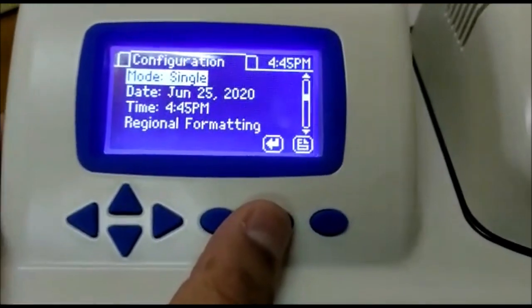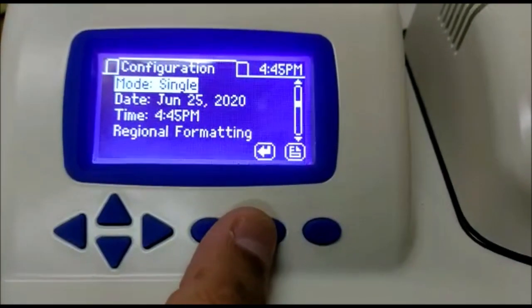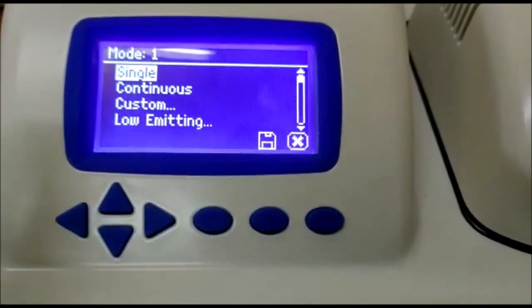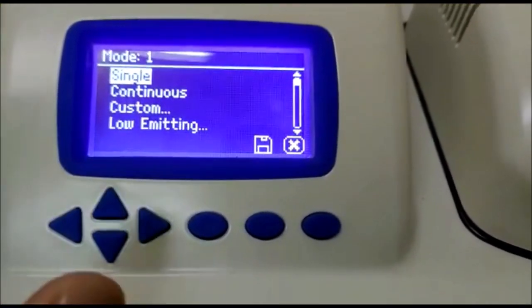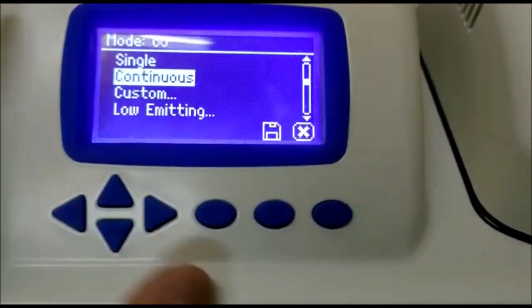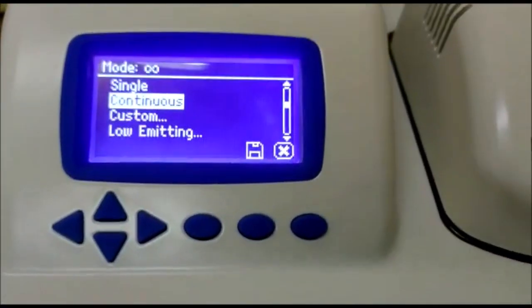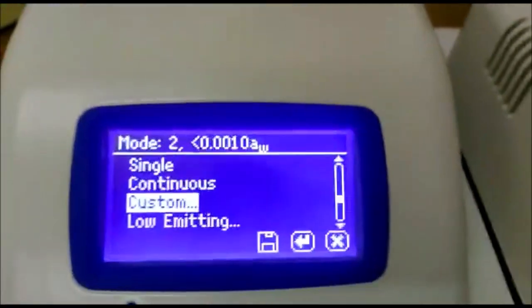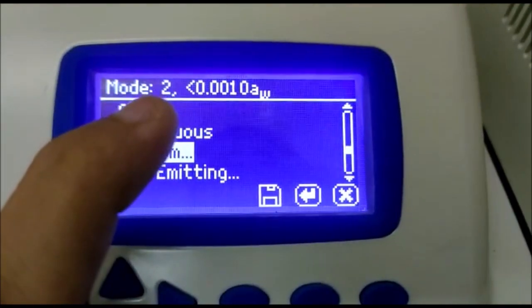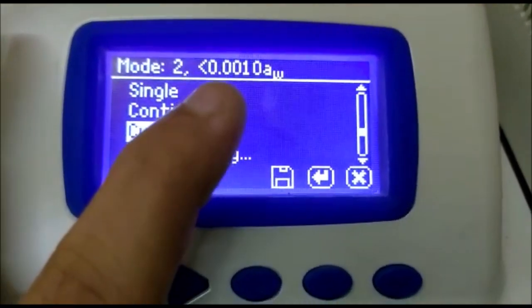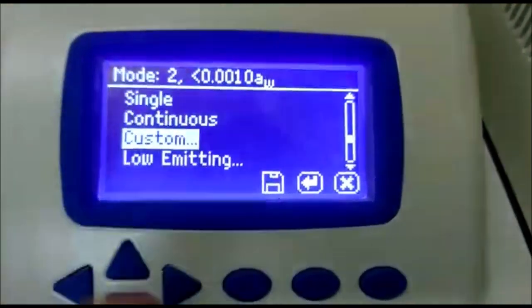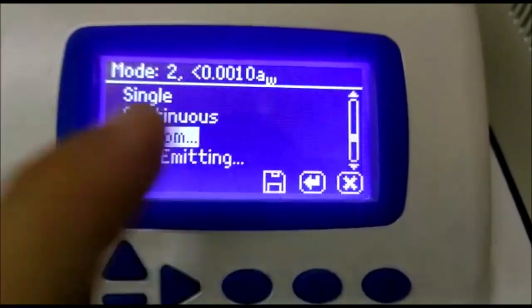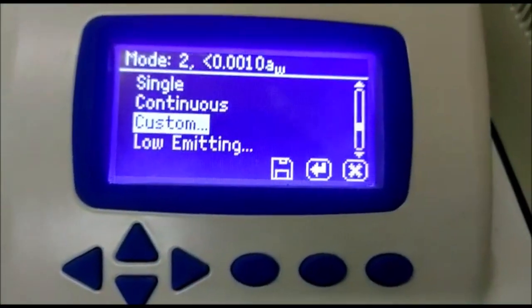Here you can select the mode of testing. We have different modes of testing. Like single, it means you have to do a single test. Generally we do this only. In continuous, it will keep on doing the test until you open the test. In custom mode you can select that my two consecutive readings should be in the range of 0.001. It will keep on repeating the test until it gets a difference of 0.001 in the two consecutive testing.